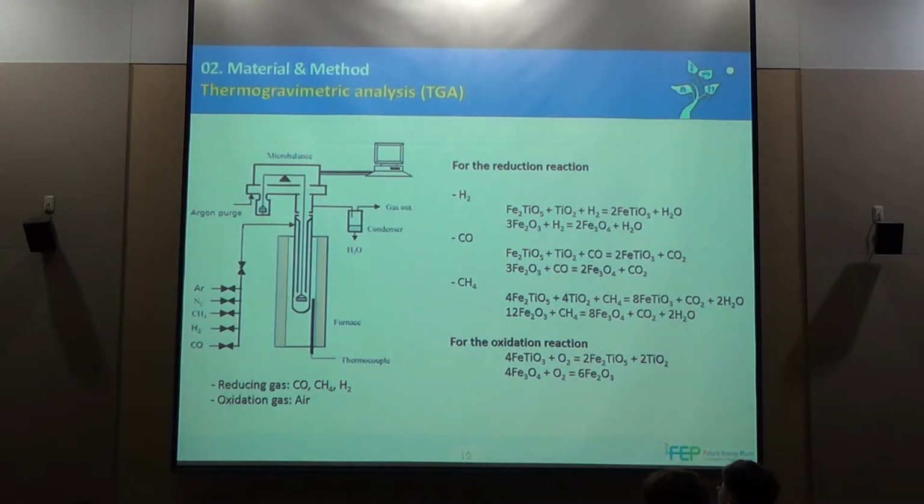As for the reactions, we expected them in thermogravimetric analysis. First, for reduction, the fully oxidized state will reduce into this final state with some syngas.